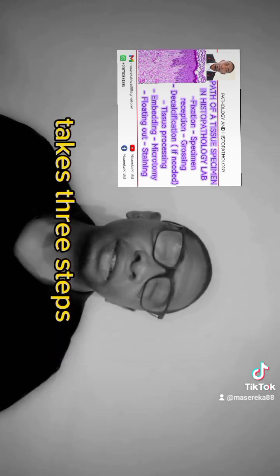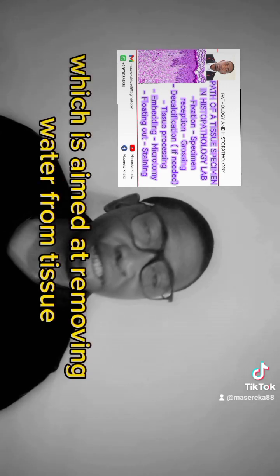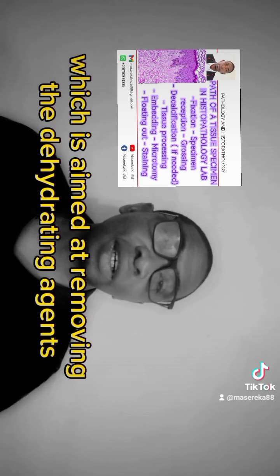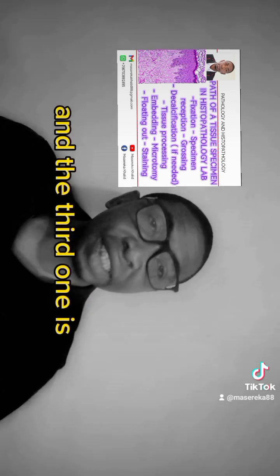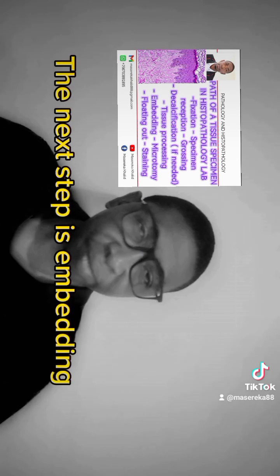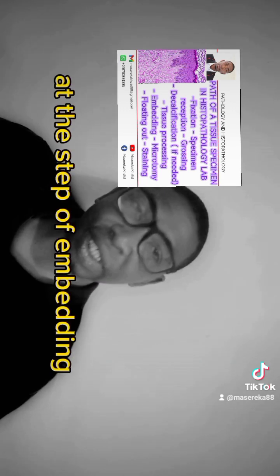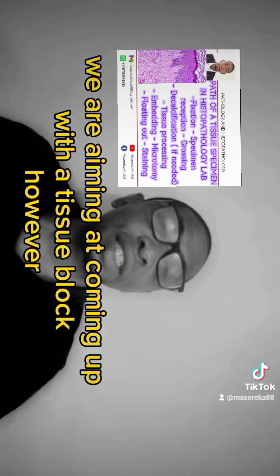takes three steps. One is dehydration, which is aimed at removing water from tissue. The second one is clearing, which is aimed at removing the dehydrating agents. And the third one is infiltration. The next step is embedding, which can be called casting or blocking. At the step of embedding, we are aiming at coming up with a tissue block.